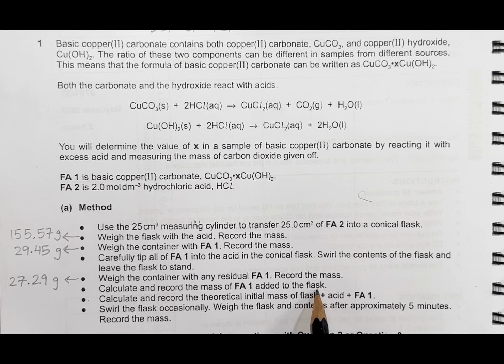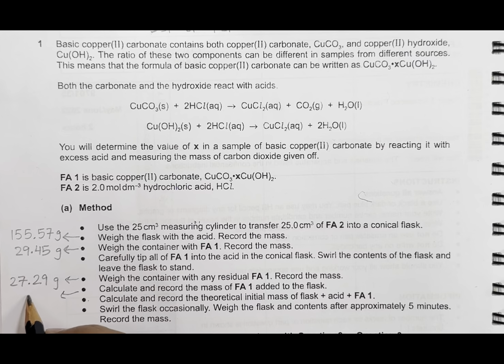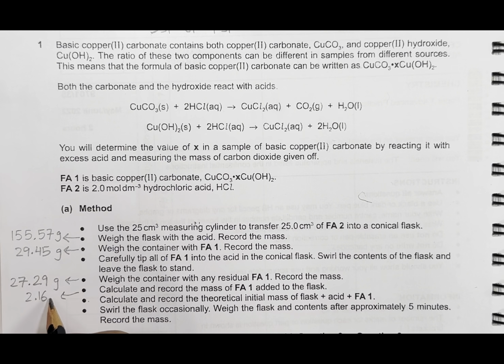Now I can take out the mass of Fa1 by subtracting the masses of container with Fa1 and without Fa1. So subtracting these two values, I will get the mass of Fa1 used in our experiment, and that is 2.16 grams.